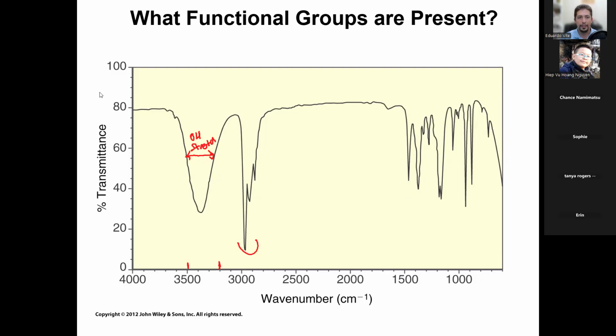So somebody said, no, you can't just be guessing willy-nilly. You have to give me evidence, right? So you said there's a carbonyl in here. Okay. Well, let me look at 1700. Right here is 1700. Is there any peak at 1700? Right? So it cannot be carbonyl. I'm glad you brought that up because that's actually something I see a lot, especially in the post-lab quiz. People just throw out carbonyl. They're like Oprah, this is a carbonyl, and this is a carbonyl. Carbonyls are at 1700s. If you're not looking at anything in 1700s, you shouldn't even be thinking of carbonyls.